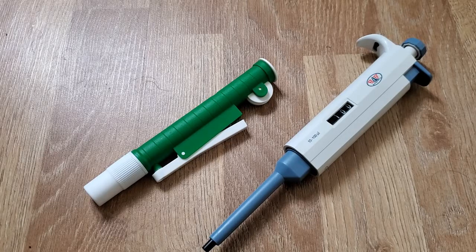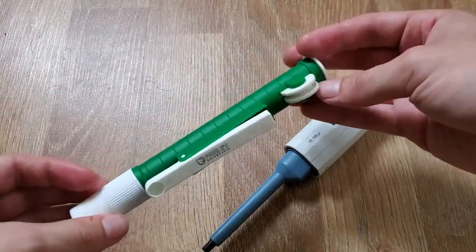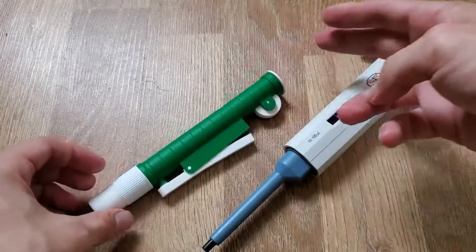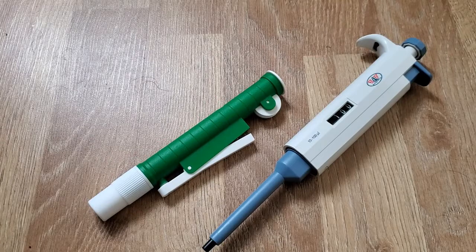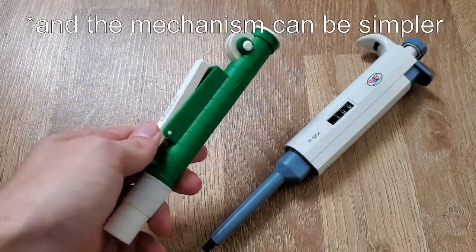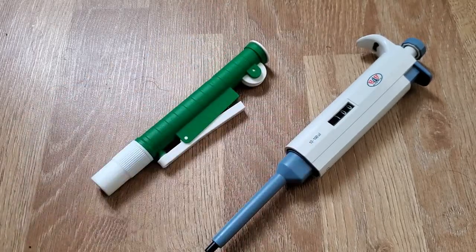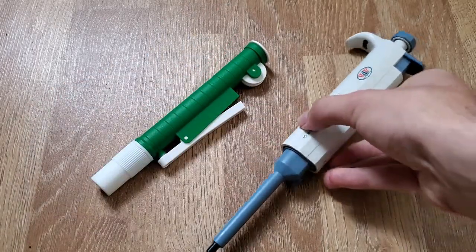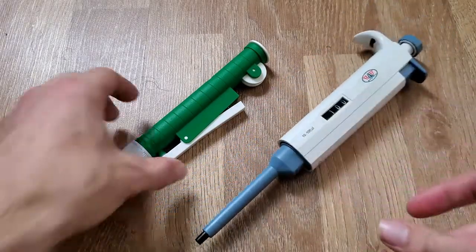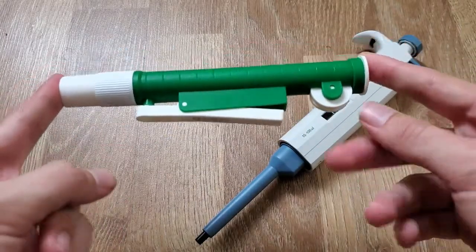I decided to go ahead and try to replicate the serological pipette. Since it's working with larger volumes, the accuracy needed in the parts is quite a bit less — you can get away with worse tolerances and won't notice it as much. Whereas with the micro pipette, if you really want accurate volumes of one microliter, that starts to get a little trickier.